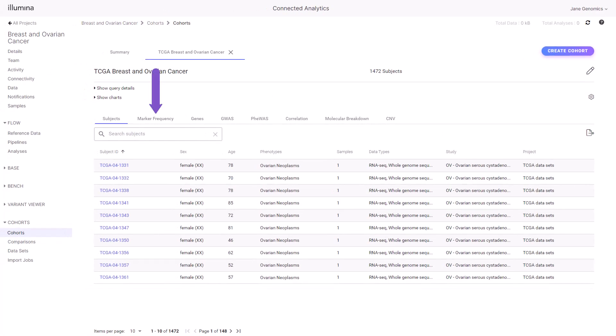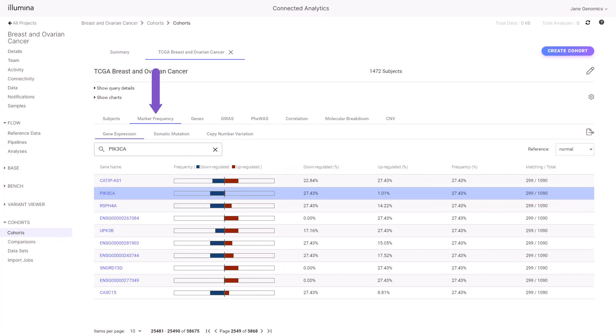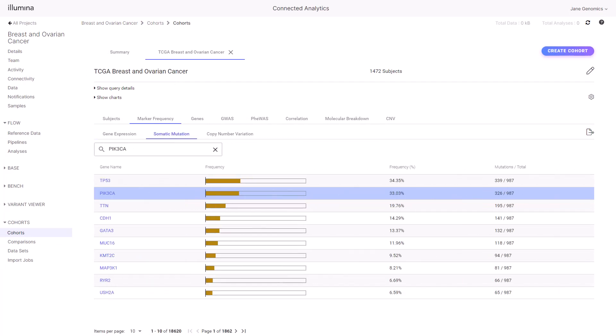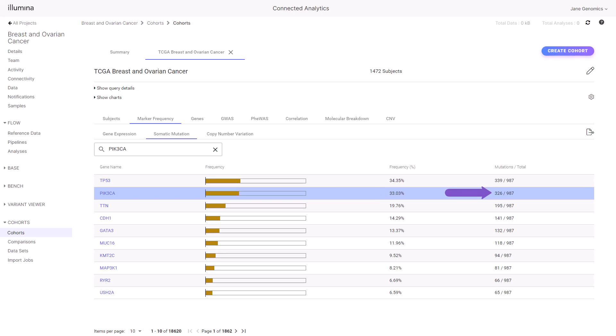Select the Marker Frequency tab, then select the Somatic Mutation tab. A ranked list of genes by highest mutation frequency is displayed. Note that PIK3CA has a high rate of mutation in the cohort, ranked second with 33% mutation frequency in 326 of the 987 subjects that have somatic mutation data in this cohort.